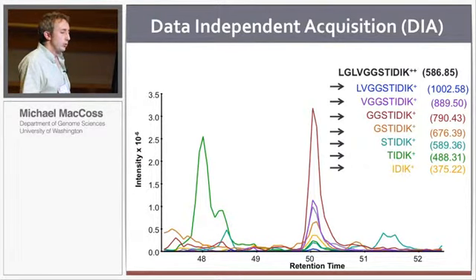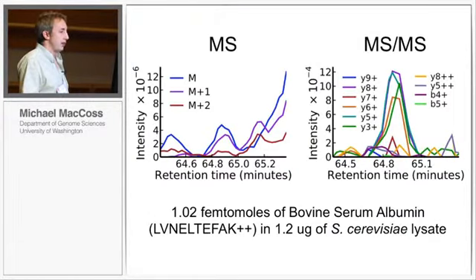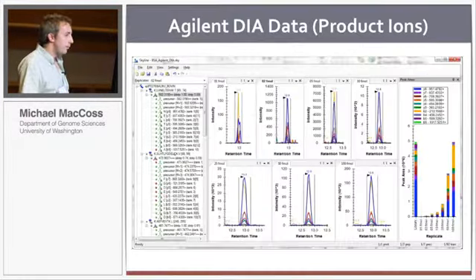And again, you use these multiple different product ions to give you confidence that you're measuring what you think you're measuring. One of the powers of this is that you often gain better sensitivity. In Skyline we can always plot the MS1 data and the MS2 data. Here's showing the different isotope chromatograms for the M+1, the M+2 isotopes. There is interference here in the MS1 data, but in the MS2 data we have a little bit less sensitivity. We lose the background faster than we lose the signal, so we gain signal to noise.